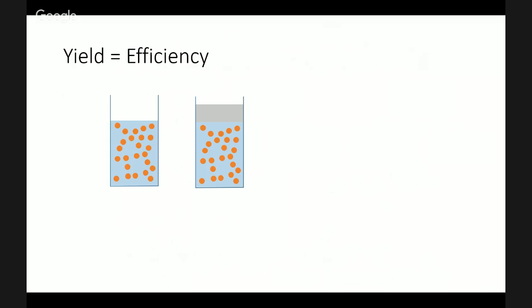Some of it wants to be in the water, but most of it will want to be in the isopropyl ether, because iron turns out to be more soluble in the isopropyl ether than the water. So we can basically pre-concentrate the sample that way. We then just siphon off the organic solvent, and that gives us a higher concentration of iron in our sample.